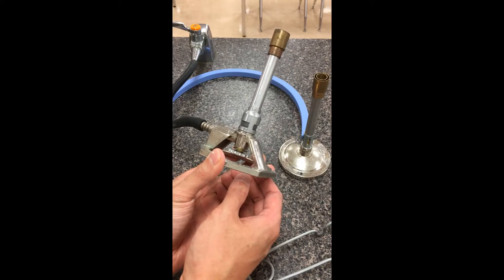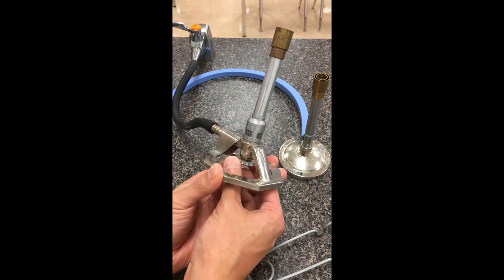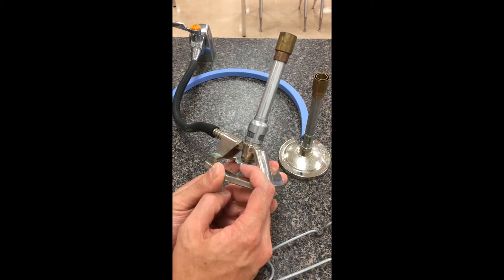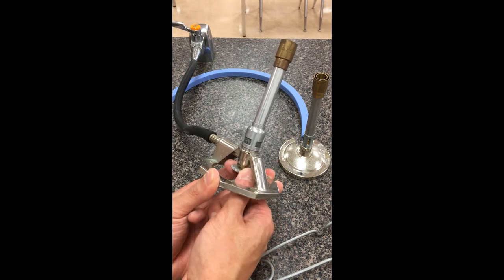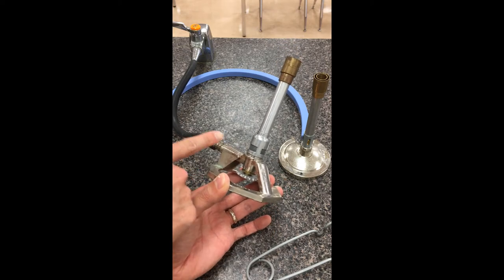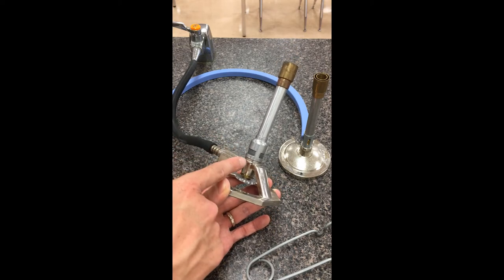For this Bunsen burner there are two things we can adjust. There's a wheel at the bottom that we can twist one way — as it gets farther from the base it gets looser — or twisted the other way. This twisting motion actually controls a valve that controls how much gas comes in at a given time, therefore controlling how tall the flame eventually gets.